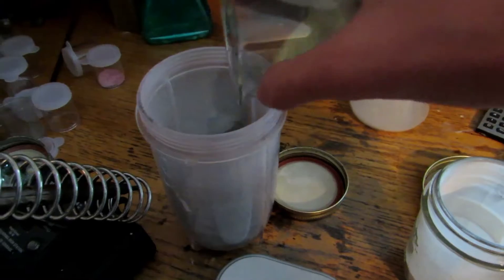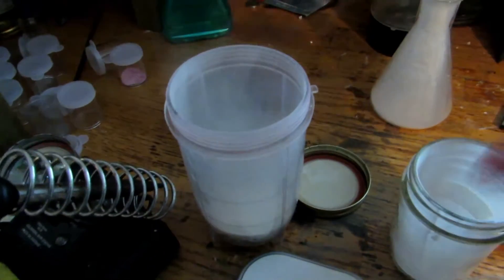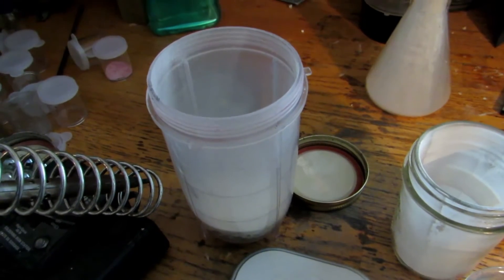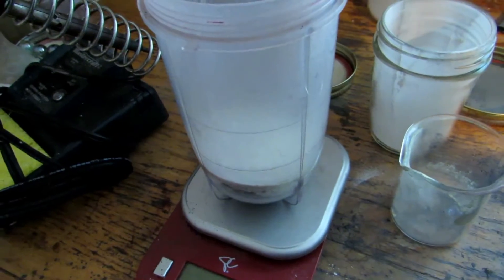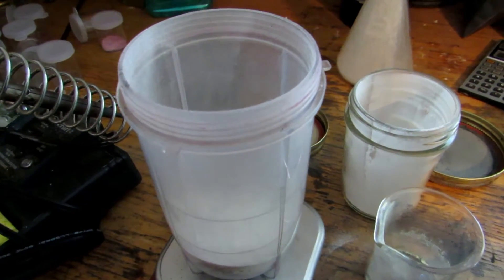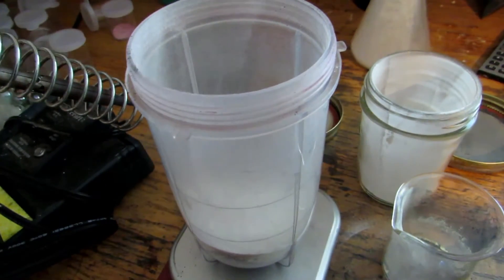We're going to take everything and dump it into this blender — just a Magic Bullet — to ensure everything is really mixed, because this is my last amount of silicon dioxide and you really want to make sure it works. I have 22 grams of silicon dioxide, 25 grams of aluminum powder, and 30 grams of sulfur. We're going to mix this up really well, blend it all together, put it in a crucible, and really hope we get silicon metal in large enough chunks to see this time.